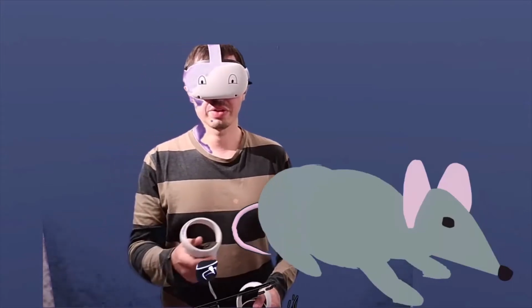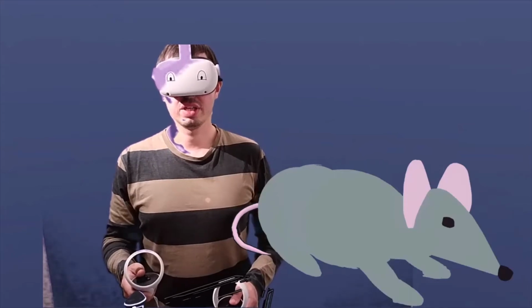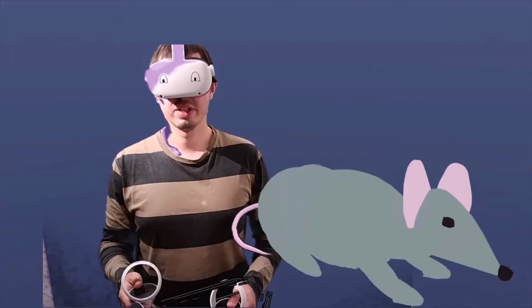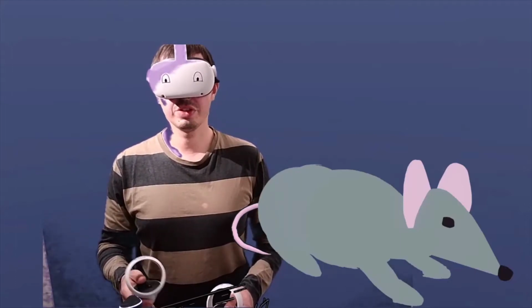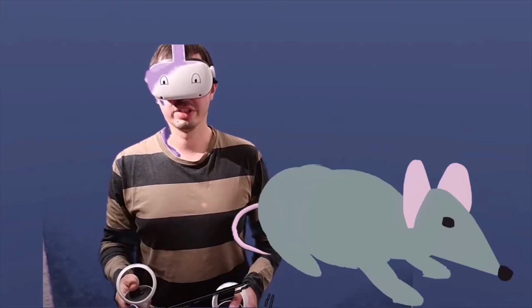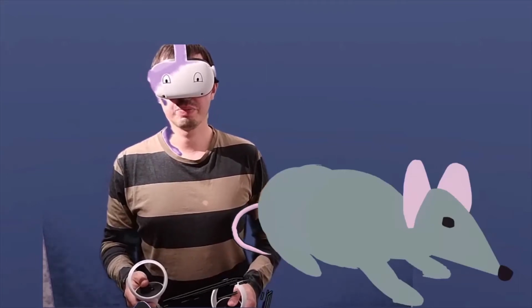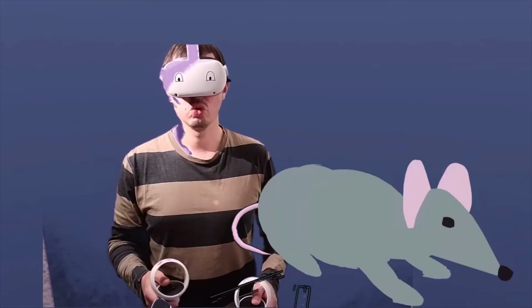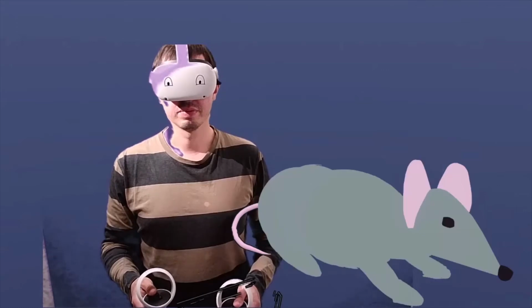So first, why the mouse? What you want is to have a human-like monoclonal antibody directed against an antigen. This antigen, which is the target of the antibody, is what makes you ill in the disease. It has a pathophysiological role. It is a protein that can be expressed, or sometimes not expressed normally, inside the body, but in this context, it makes you ill.